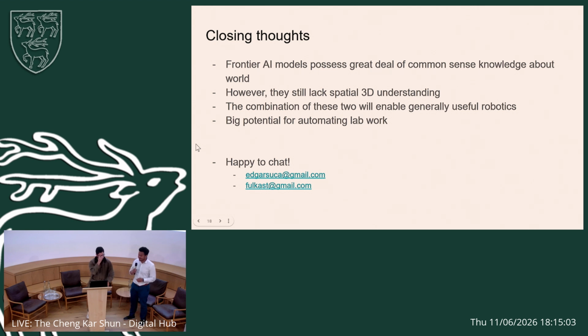Yeah. So actually, that's the beauty of pinhole projection. Even in microscopy, where the scale of the actual dynamics is very tiny, on the image it's still actually a pretty large image, right?